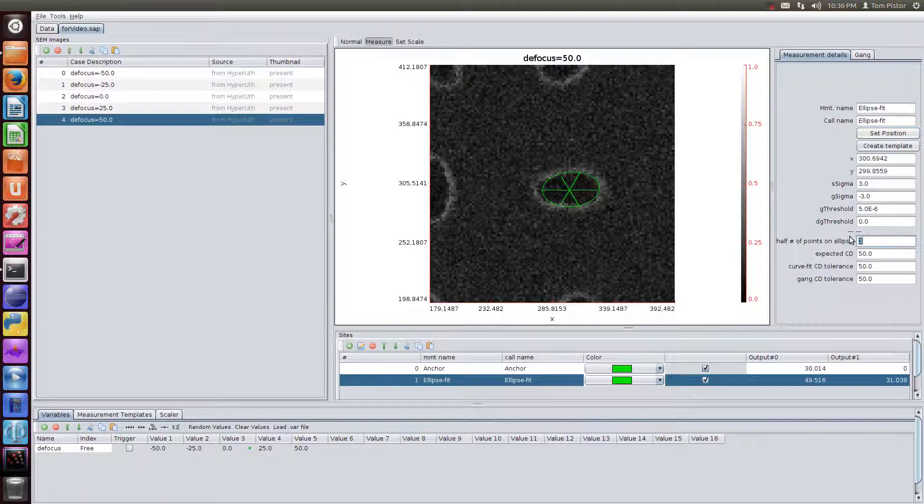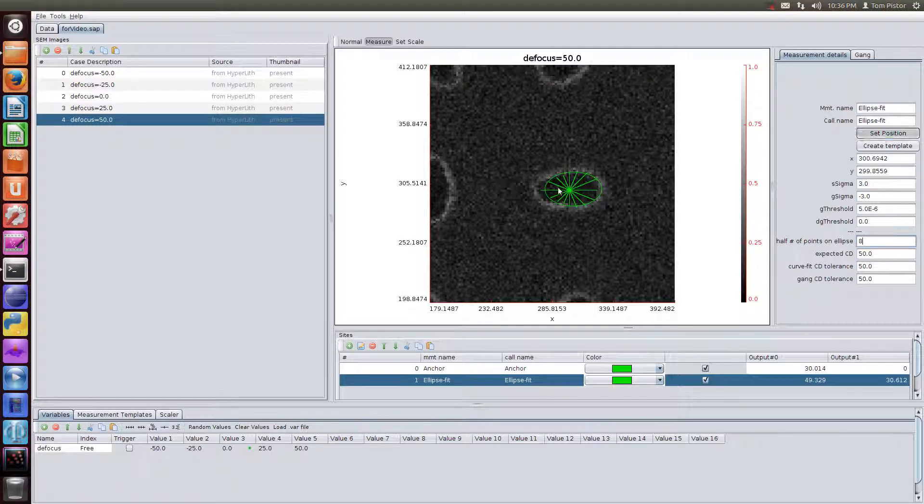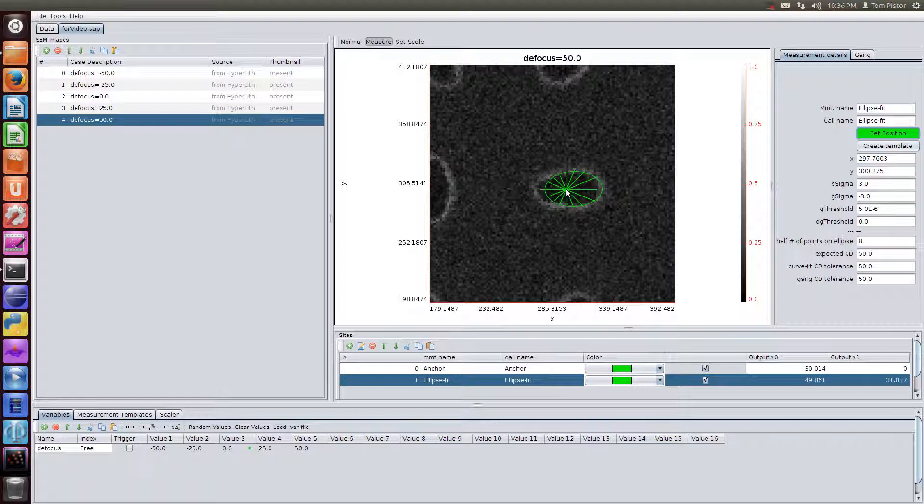So we can choose that we want more spokes, or more angles, or more points on the ellipse. Eight is a good number here. And I'll set the position a little bit better. We'll measure this horizontally oriented contact.